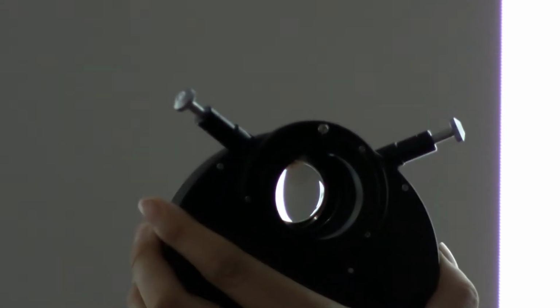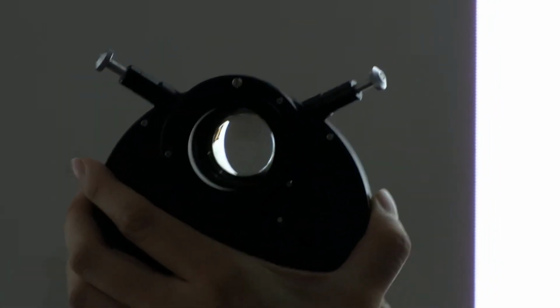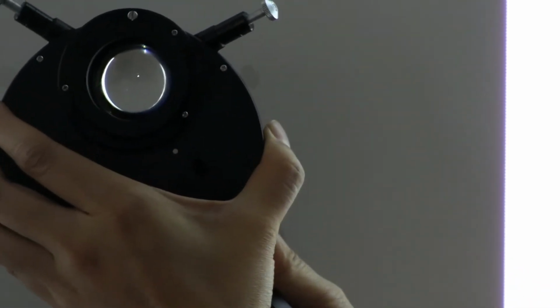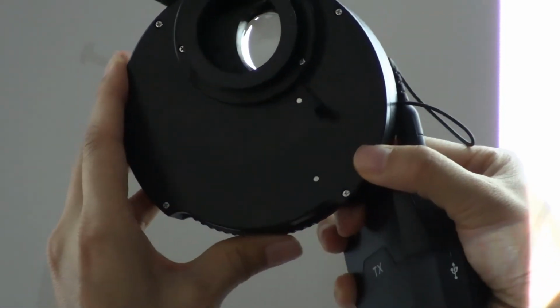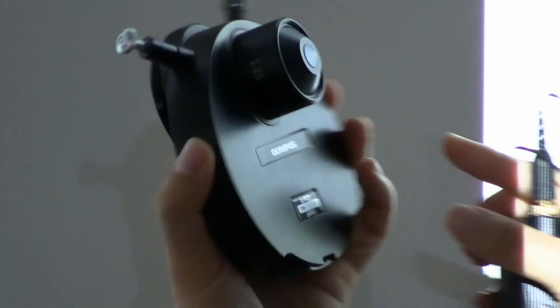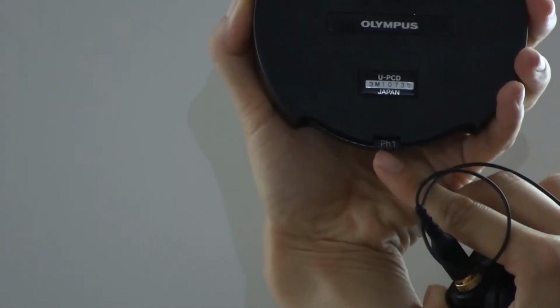So here you can see the lens, or there's no modification here. It's 0. So this will be used for the bright field microscope. But when you try to turn here, you can see a little word, right, phase 1.